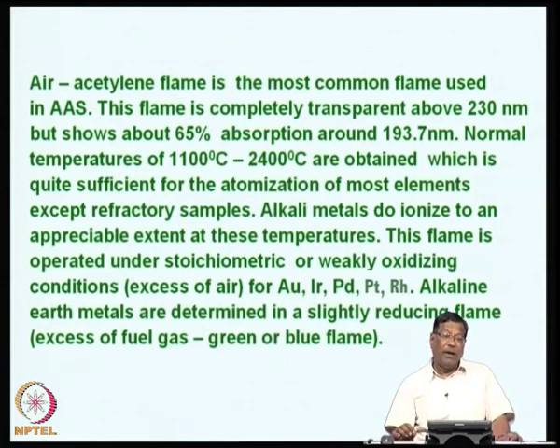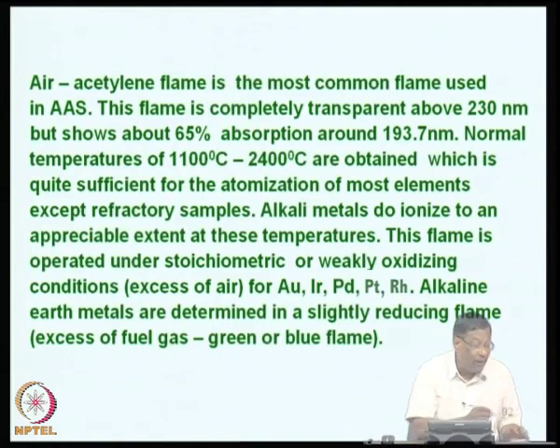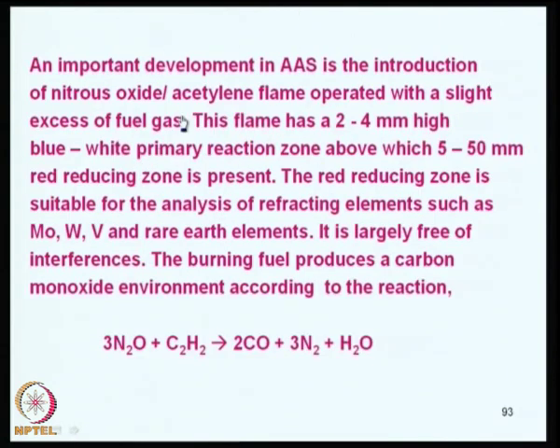So, it is called a reducing flame. Oxidizing conditions are good for gold, iridium, palladium, platinum and rhodium. Alkaline earth metals are determined usually in slightly reducing flame. So, there is always a possibility for us to play around with the composition of the gas, so that we can determine the element at its highest sensitivity.